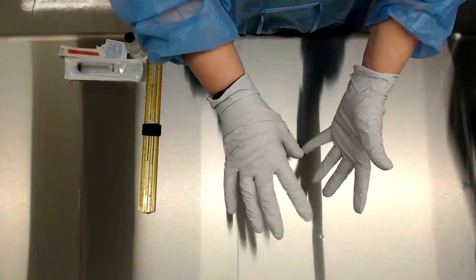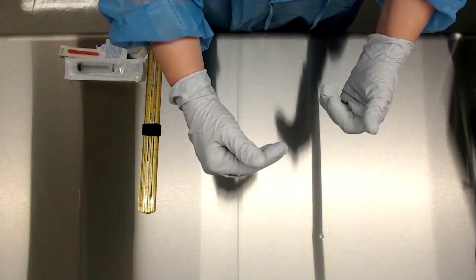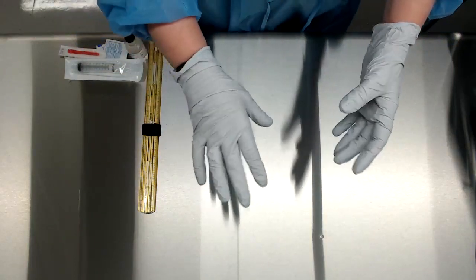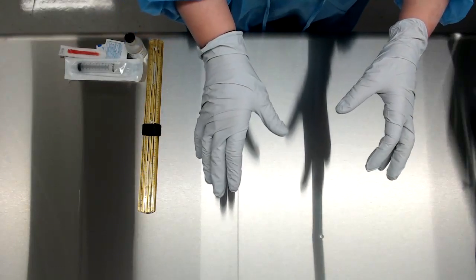We won't always have a ruler in here, but initially when you practice you can keep an eye on that until you get a good idea of where the six inches is. That is something they will definitely be looking for on the part three exam.